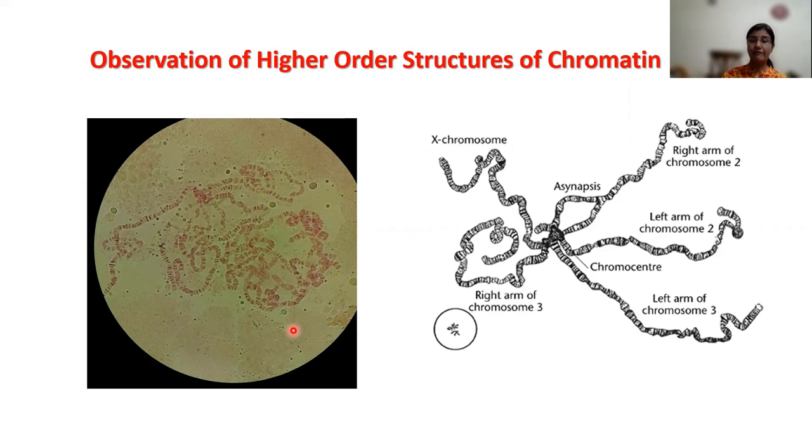Now, polytene chromosomes have been widely used in a variety of genetic, cytogenetic, and molecular studies on gene expression. These chromosomes remain in a permanent interphase, but due to repetitive endoduplication cycles and tight lateral association of all the daughter chromatids, each chromosome becomes thicker and distinctly visible under the light microscope. We are able to see the darkly stained regions and the lightly stained regions, which are also known as bands and interbands.